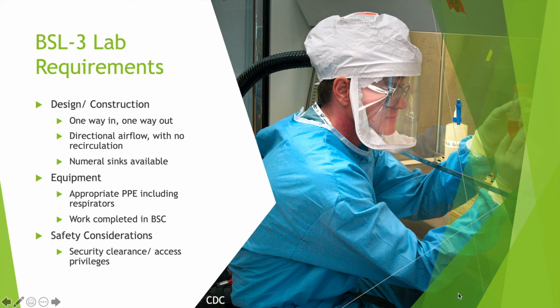Once again, since we're working with aerosol pathogens here, respirators with independent air supply are likely necessary also. In addition to this, all work must be performed in a biosafety cabinet. Street clothes are mostly prohibited, so researchers may change into scrubs to prevent contamination to those. Hand sinks and eye wash stations must be present and accessible in case of an emergency or possible contamination from a spill, needle stick, glass break, or equipment malfunction, both inside the lab and in the ante rooms.